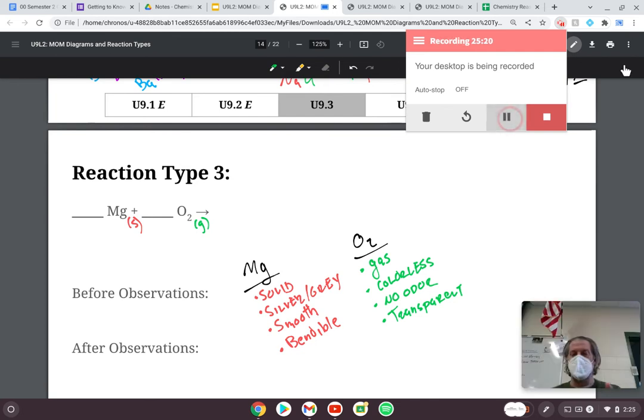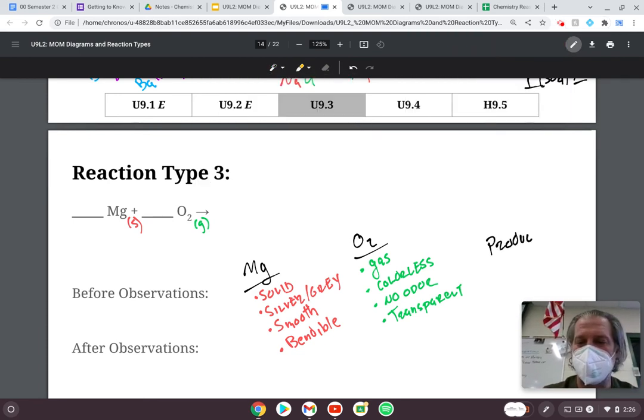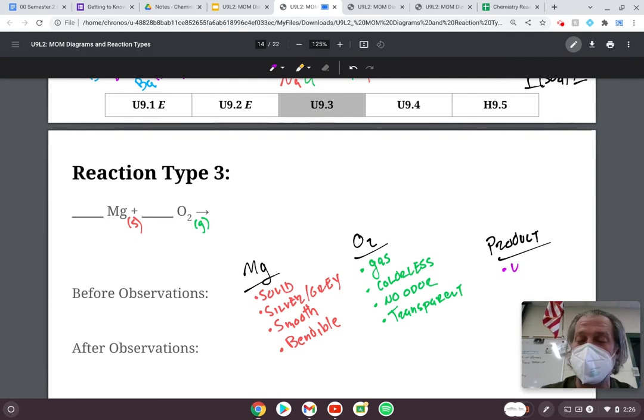Okay, so this is the product that we produced. Some people have said there's a lot of ways that we could describe it. I don't know how to best show you that. Look, there it is. Other than the fact that the product obviously changed color, there's an obvious color change, and you might say that it turned white for sure.